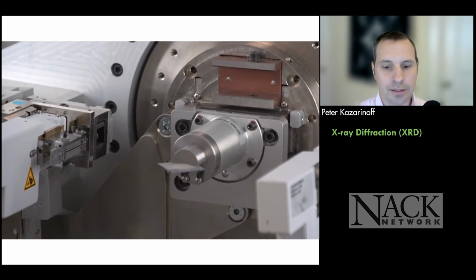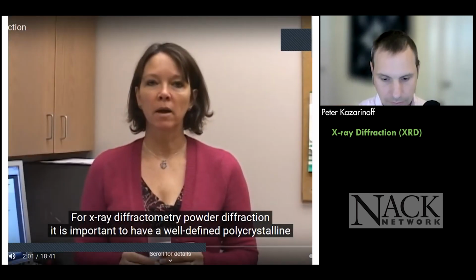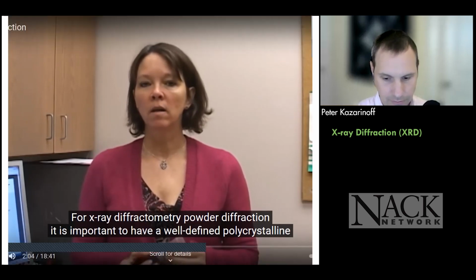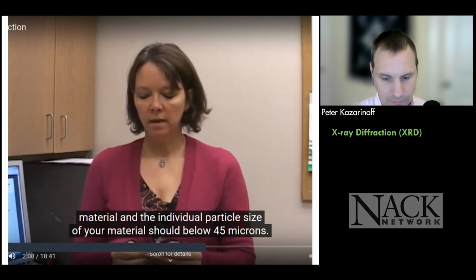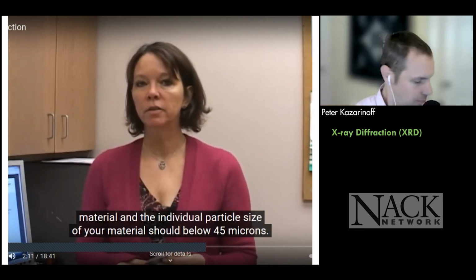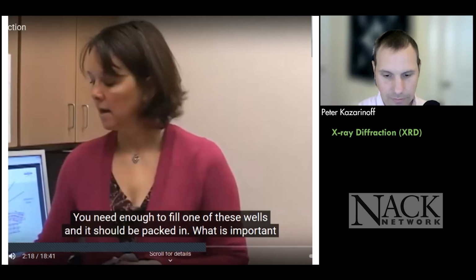Now, the last video that we're going to take a look at for XRD is going to come from Tuesday Kirkendall, who is a technician at the University of Washington. For X-ray diffractometry, powder diffraction, it is important to have a well-defined polycrystalline material. And the individual particle sizes of your material should be below 45 microns. You need enough to fill one of these wells, and it should be packed in.